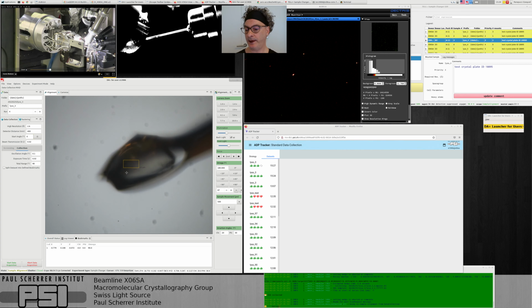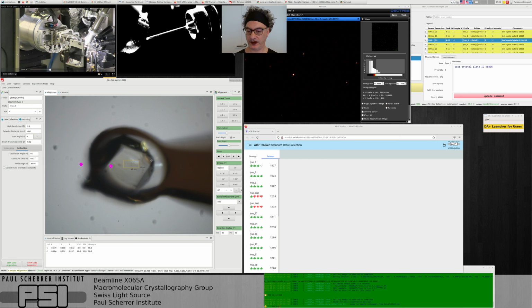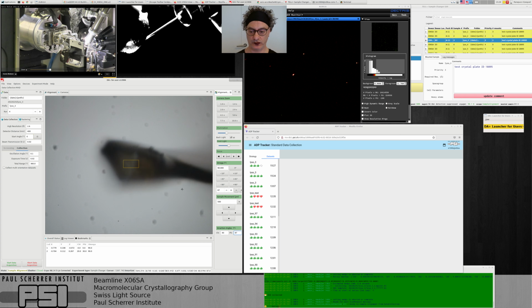So independent of what chi or phi you have, aligning the crystal is always the same. So again, another position here, and now in here as well, and I'm going to go to chi 40 and phi 87. 87 is always a good number to go.